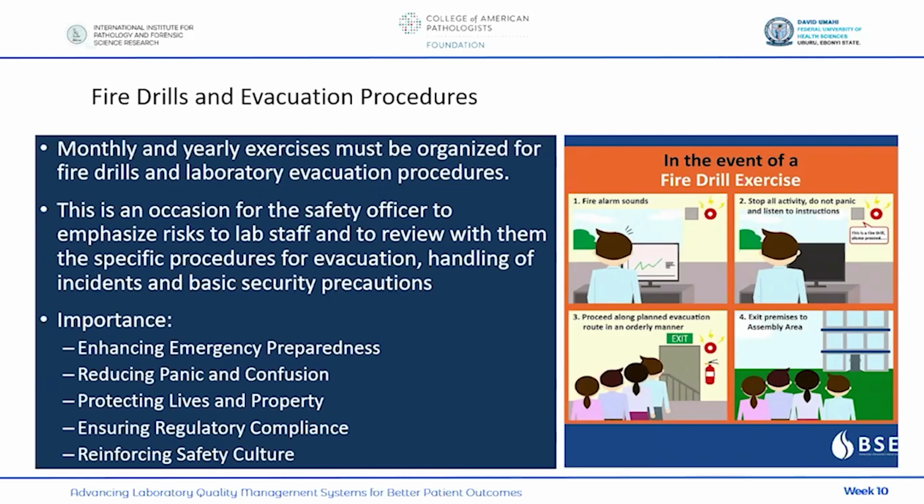Okay, sorry. So in the event of a fire drill, the fire alarm sounds. So if you have a fire alarm in your setting, you regularly check it. This is also something important. You regularly check it, and this fire drill will give you an opportunity to check that your fire alarm is sounding. Okay? And if you don't have one, you improvise.